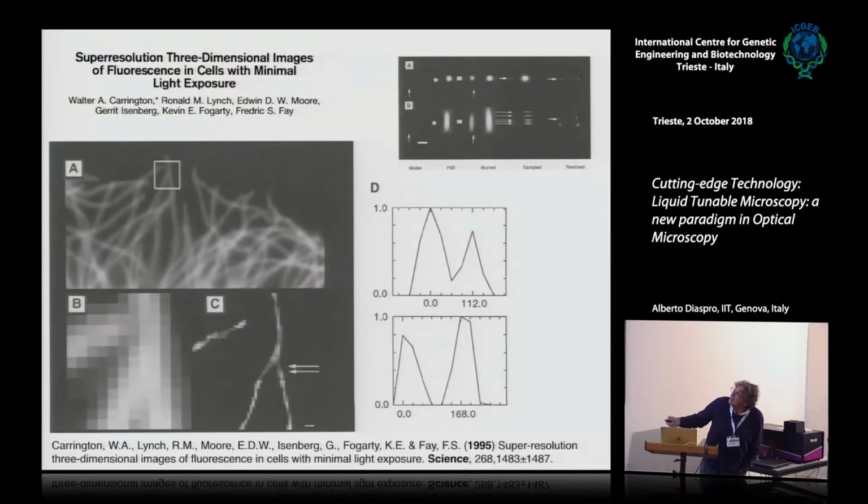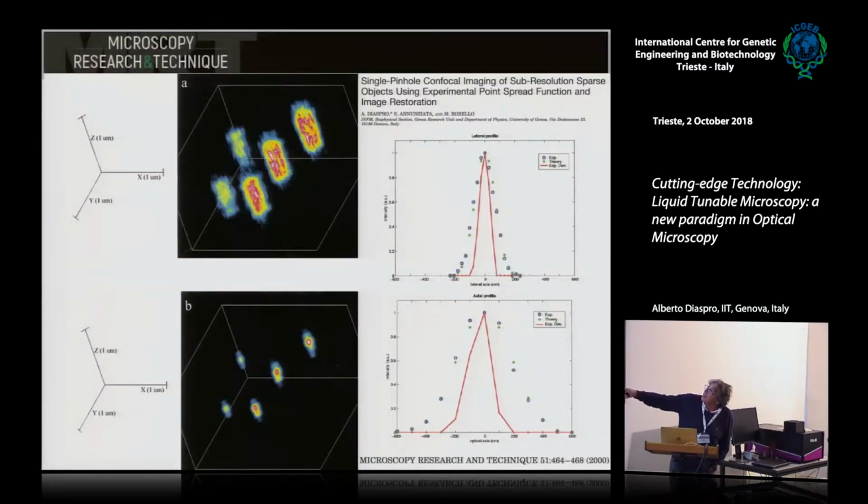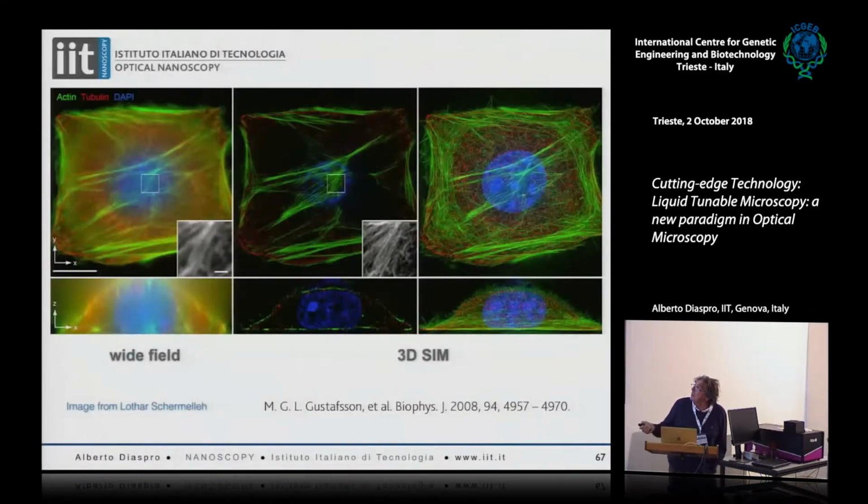Or you can use some other information when you perform some computation on your sample and you use some information of your image formation system, you apply this information to the data you collected, and you try to improve with some processing what's going on. So, for example, before in the three-dimensional space you could see spheres in this way, and now you see them sharper. Or you can implement, Mats Gustafsson did this, you put on the shoulder of your signal a signal that you know very well, that comes from gratings, moire patterns, or whatever you want, that you insert in your image formation process. You know them very well, and they carry on their shoulders the unknown frequencies that you couldn't see from your sample, that you can reveal when you reconstruct the image.